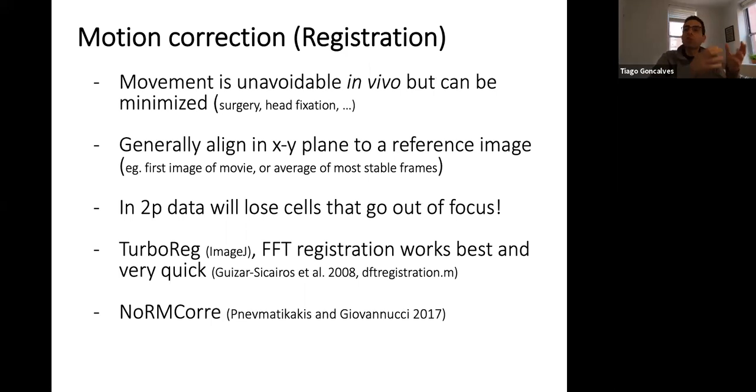And convolution is a multiplication in the frequency domain. So what you can do is, if you move everything to the frequency domain, the kind of operations that you're making are actually multiplications, and it makes it computationally much easier, much quicker for the computer to perform this alignment. And that's why these tools have been extremely useful.